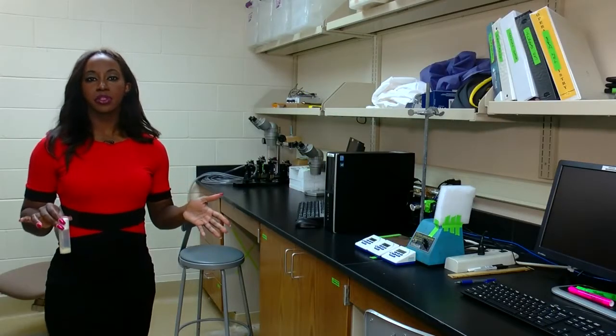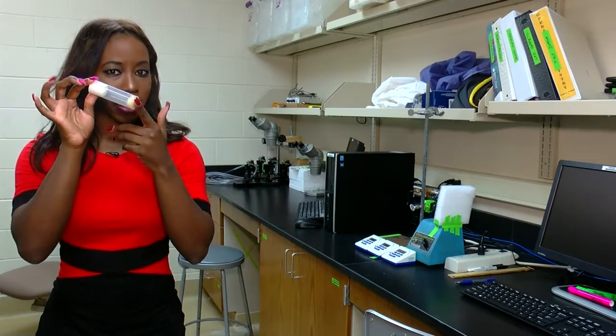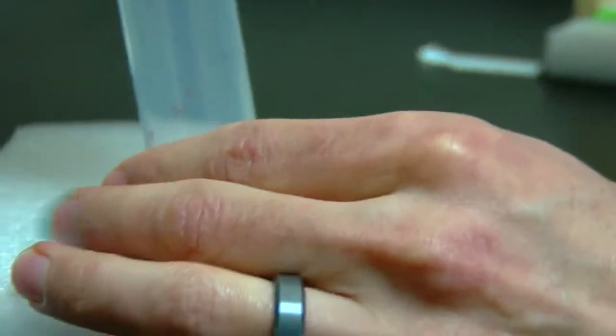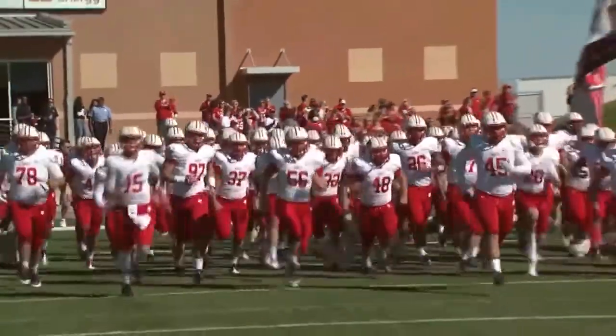This is the lab at UWGB, where tens of thousands of flies are tested each year. And believe it or not, we humans share some of the same genes as these little guys that you sometimes see on your bad bananas. We trap all the flies in the vial and then set the plug height so they're about the same. Who knew flies and football players had something in common?